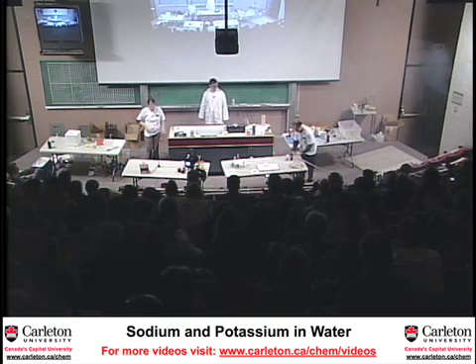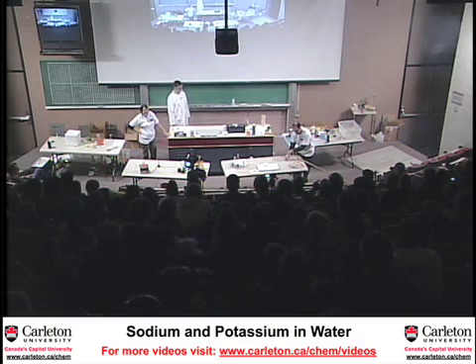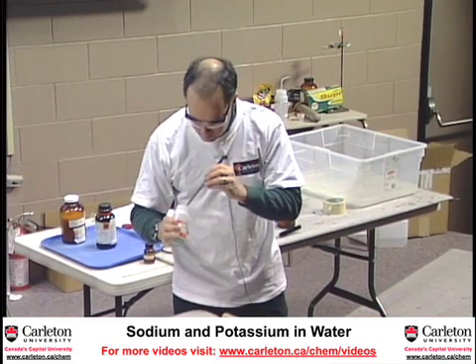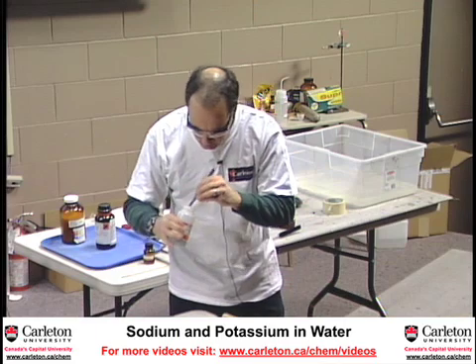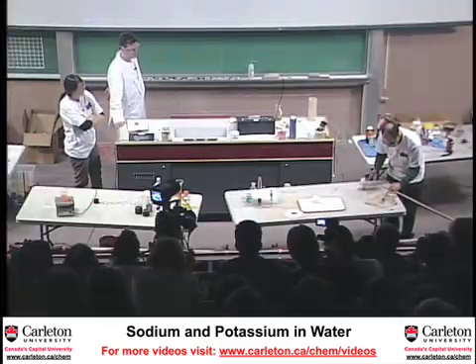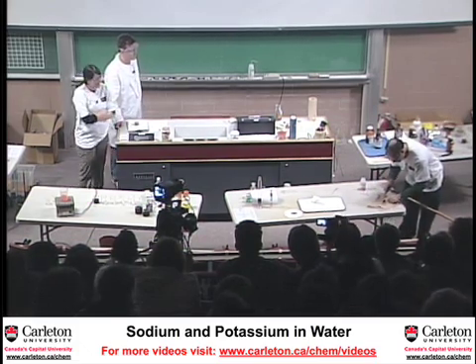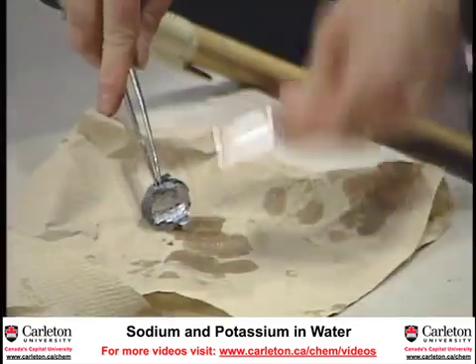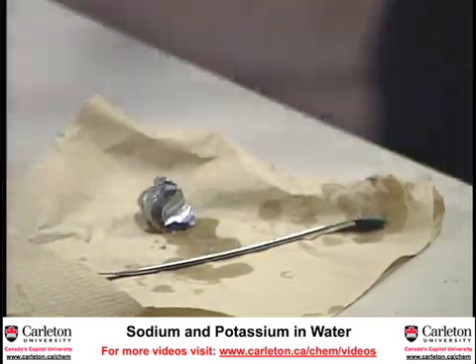Now, would you believe that I don't think of sodium as being very reactive? But I do think of potassium as being reactive. Potassium is the next element down in the periodic table below sodium. I'll take a piece about the same size as the piece of sodium — you can see it's a nice shiny metal. And we'll stab that and drop it into the water.